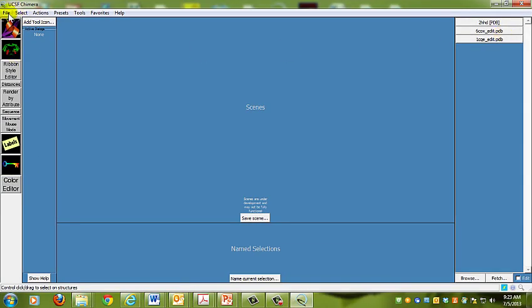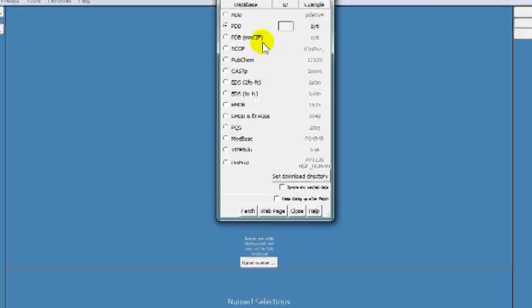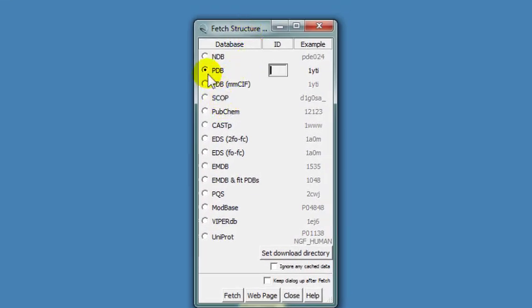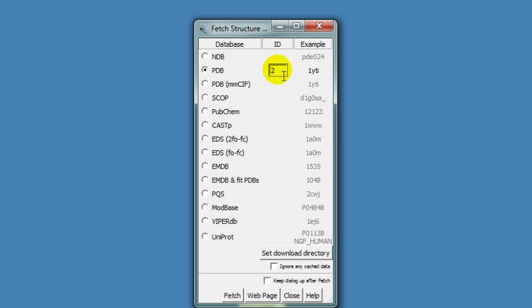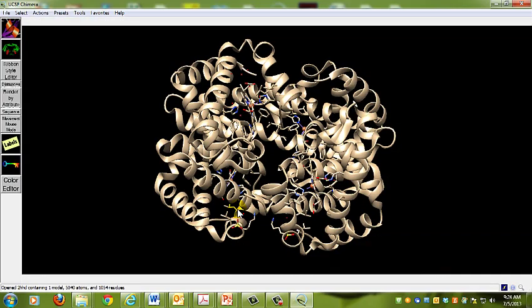I'm going to my desktop and I have Chimera 1.8, the newest version that just came out in June. It has a neat function called fetch where you can fetch the structure by ID. The default is to go to the protein data bank. For deoxyhemoglobin, the structure is designated by 2HHD. Once you put that in and hit fetch, you'll see the molecule pop up on the screen.